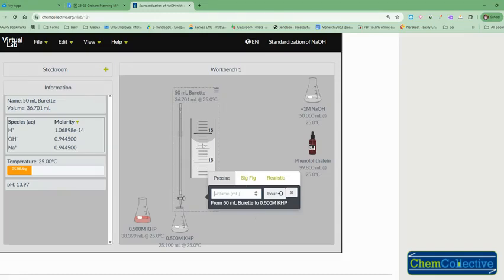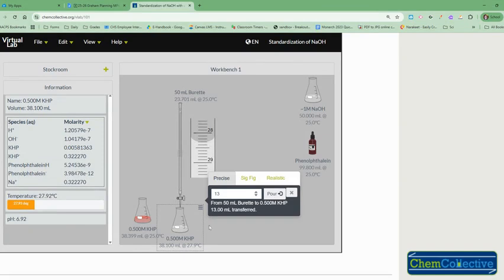My new starting point is 15.3. So for trial 1, my starting point is 15.3, and that's my initial. I know that I can add 13 very quickly, and I do not have a faint pink color, so I don't want to add that much again.